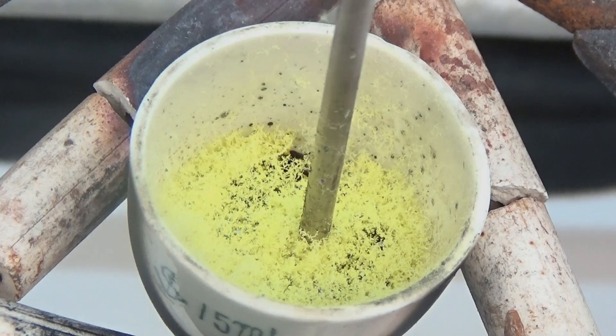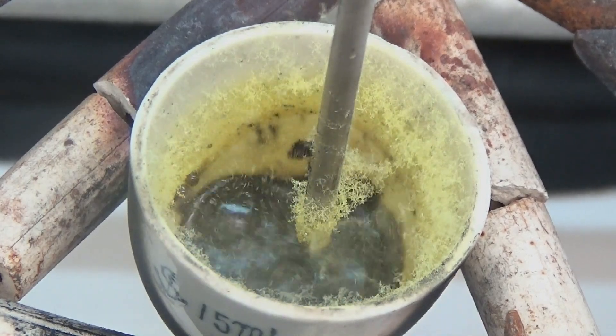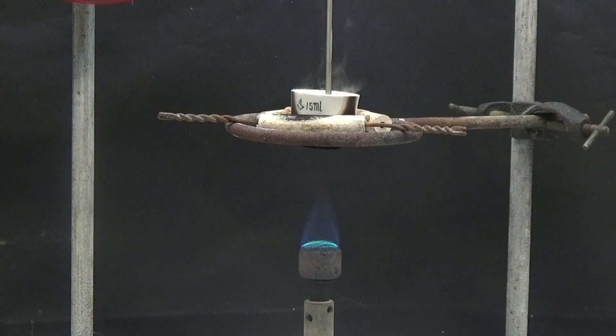When acridone is heated in a crucible, it is observed to sublime with yellow color. The yellow color is the original color of acridone. One way to purify the acridone would be by sublimation.